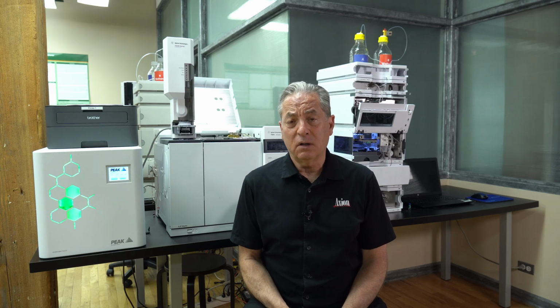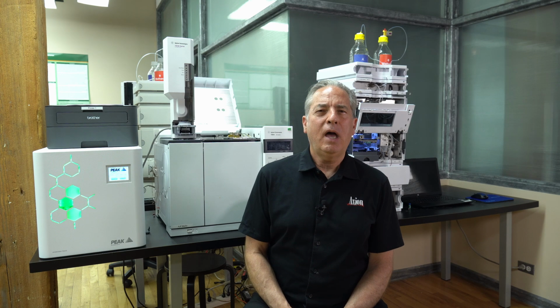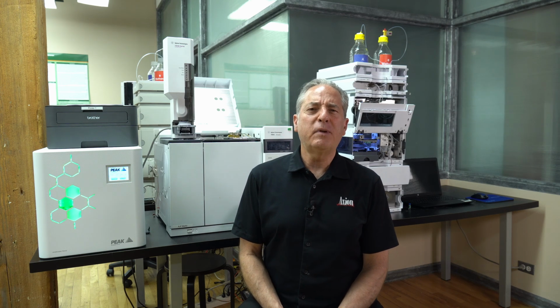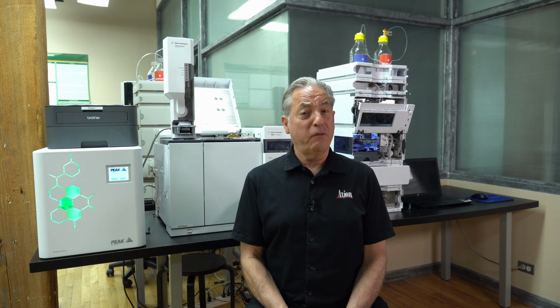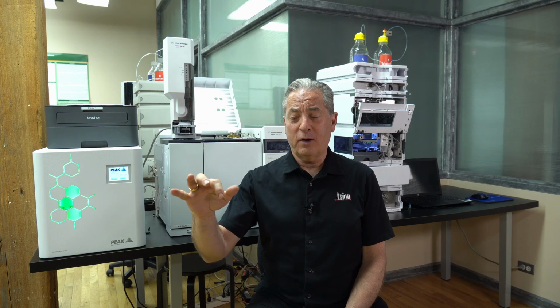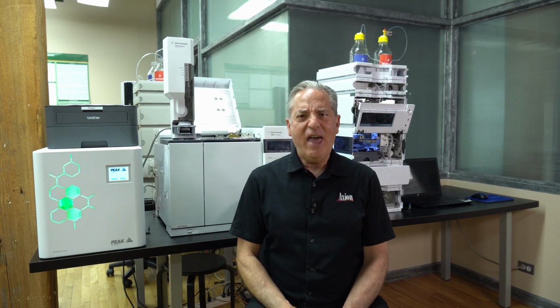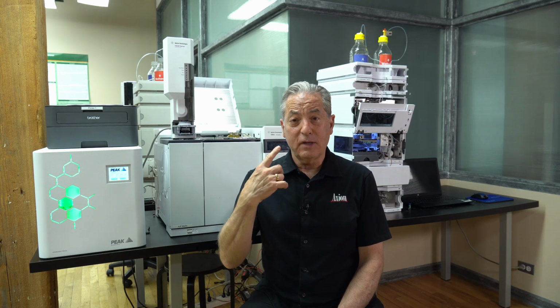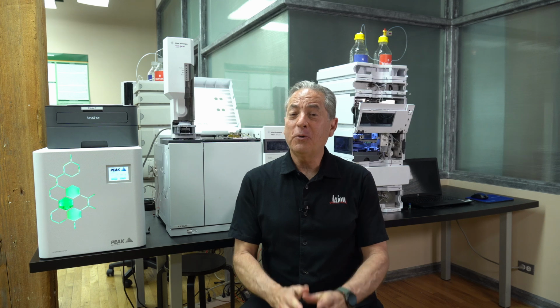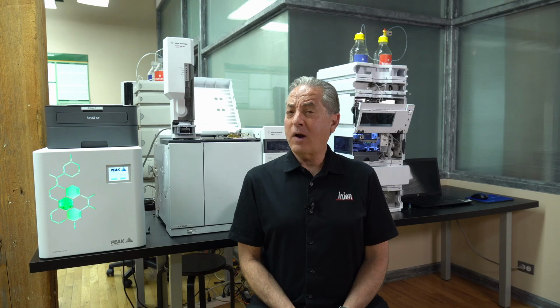Again, in LC, you're going to wear your safety glasses when you're around the instruments, because you do get splashing. And I will say, it's happened to me when I was in graduate school. I'm working with an HPLC doing gel permeation chromatography, methylene chloride mobile phase, wonderful mobile phase, fantastic stuff, except for the fact that the little piece of plastic tube, when I was taking it out of the waste container, flicked right into my eye. I was not wearing safety glasses, and ow, it really hurt. So I didn't lose the eye, and I washed it out. But I'm pretty careful about safety glasses ever since then. So those are my tips on how to answer the question, what would you look at from a safety perspective in a chromatography laboratory.